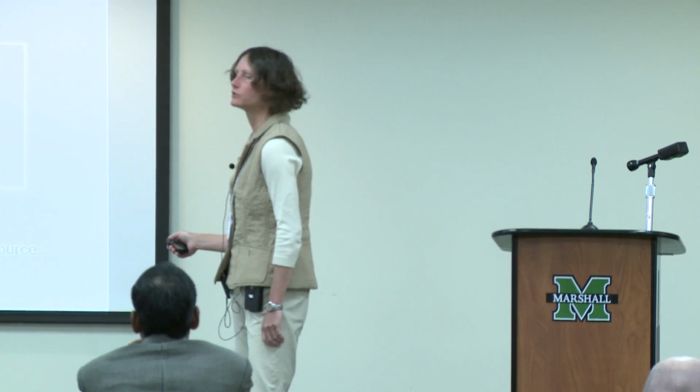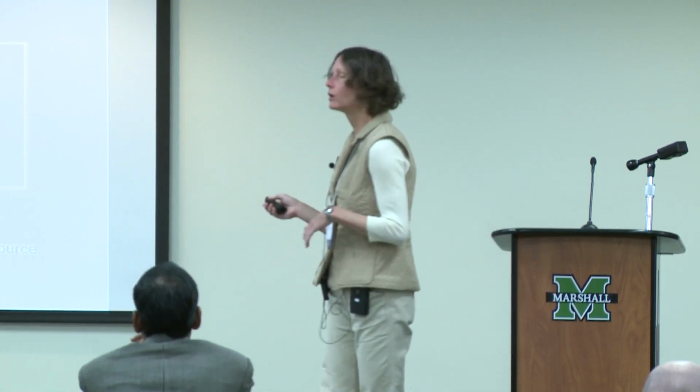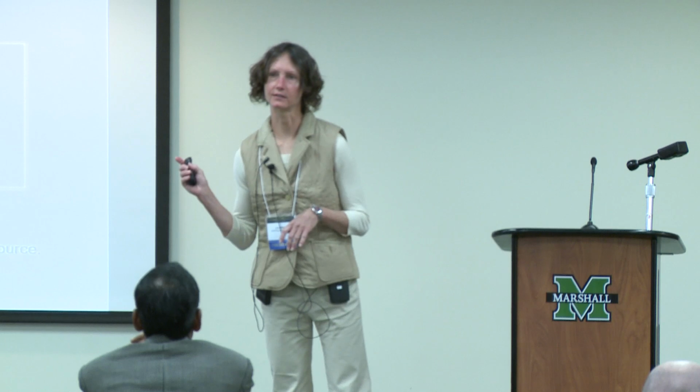the third-party software that's required to do this sort of computing. So this is where Jack Smith and Tony and the high-performance computing cluster come in, because I am able to PuTTY on into their machines where they host the software that runs these analyses. And I can set up an analysis, go out and drink a cup of coffee, and 20 or 30 minutes later the work is all done on the high-performance computing cluster, and I can go back in and export the results to my own laptop. So this sort of thing couldn't even be done without their help either.